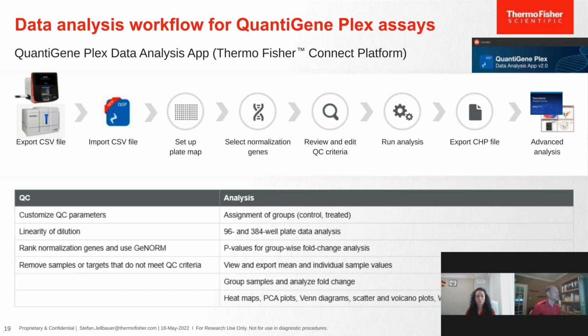And by the way, I want to remind you that we have a similar analysis tool also for our ProcartaPlex assays.